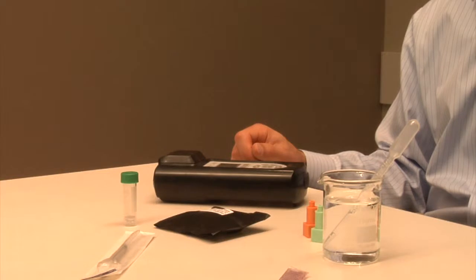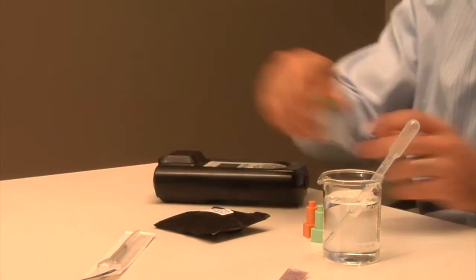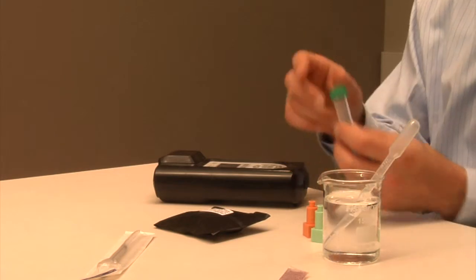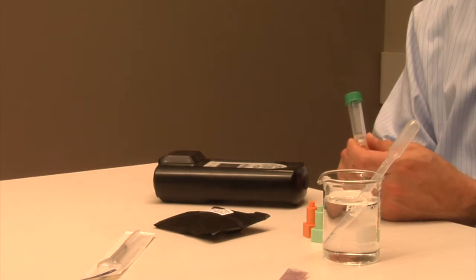Next, let's prepare the buffered solution. For this, we will use the buffer solution tube, which you will notice contains a small amount of material, which is designed to bring the pH of the test solution to pH 7 for lead or a pH of 5.5 for uranium. Open the tube carefully so that the material does not fall out.